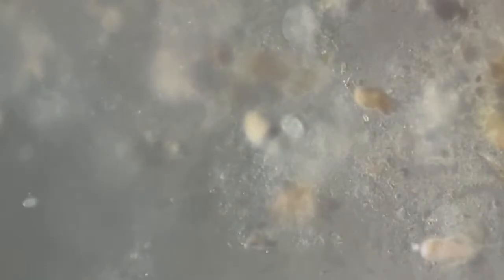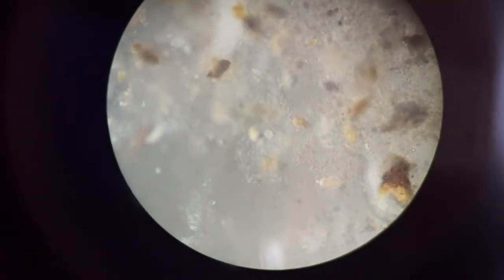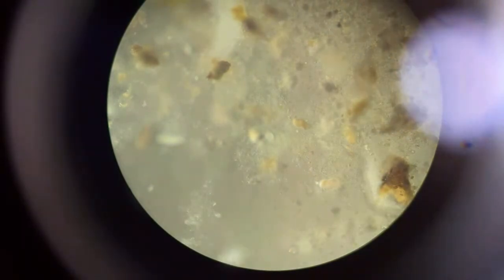Once we are done, things would be easy for us. It's just a matter of minutes. There it is. We just need to focus it a bit more. Now, doesn't it look like a moon?